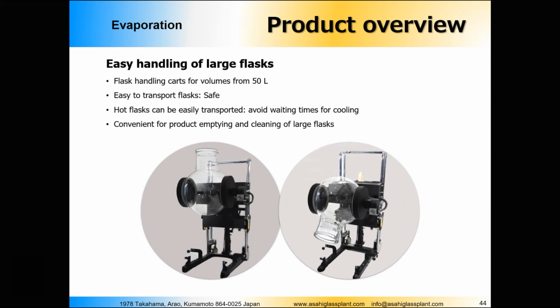Imagine you have, let's say, 4 kilograms of powder that was dried inside the flask. In total it is 8 kilograms, which is relatively heavy. And if you are a lady, it is not that easy to operate even with 8 kilograms in your hands, especially if it is slippery because you use an oil bath, for example.